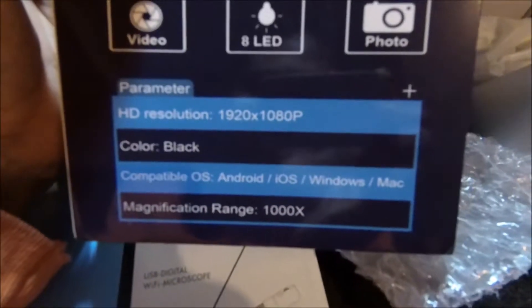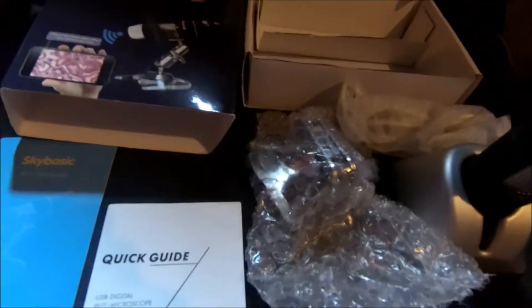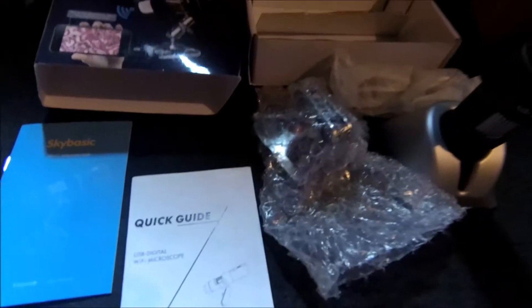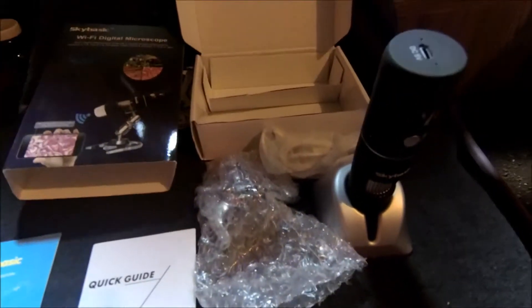I gotta read the manual, see what the details are, mess with it, and then I'll do an in-depth review — cover the functions and talk about it. But yeah, it's just a quick unboxing for now. I'm gonna look into this so I can give you guys all the details of how to go about it.